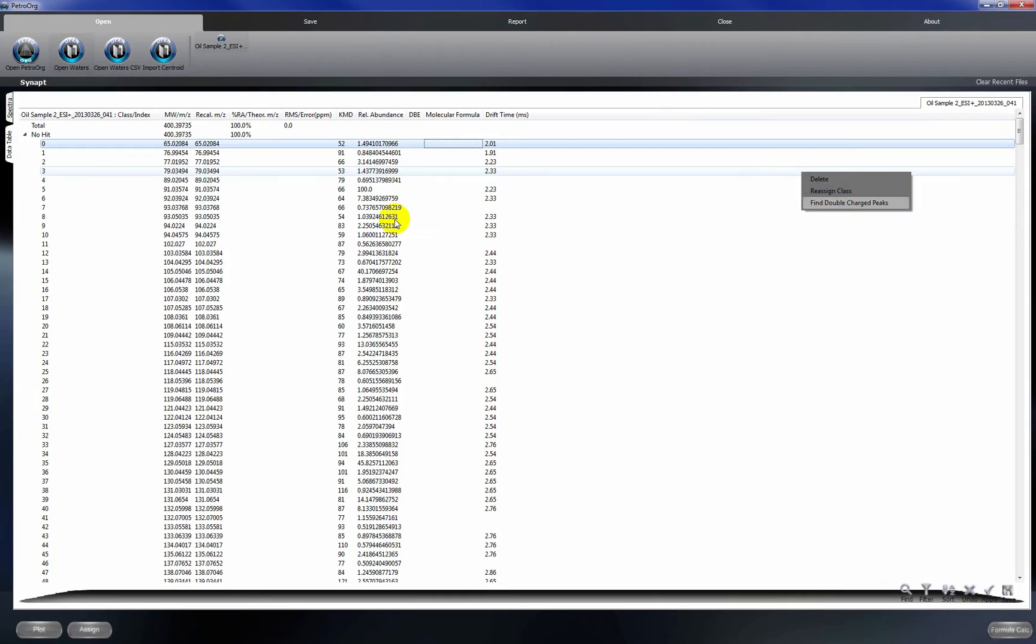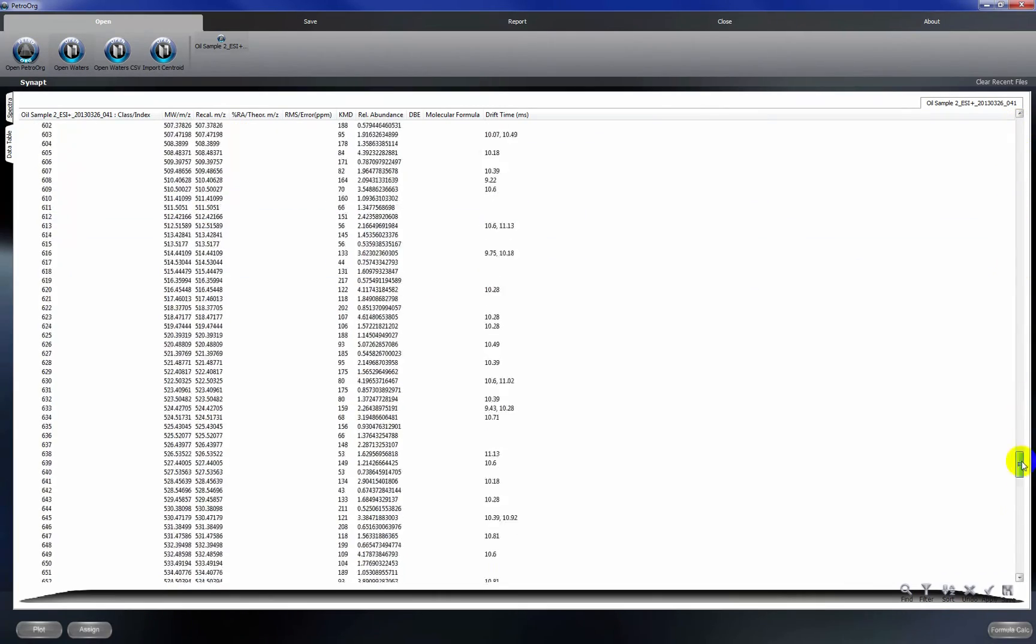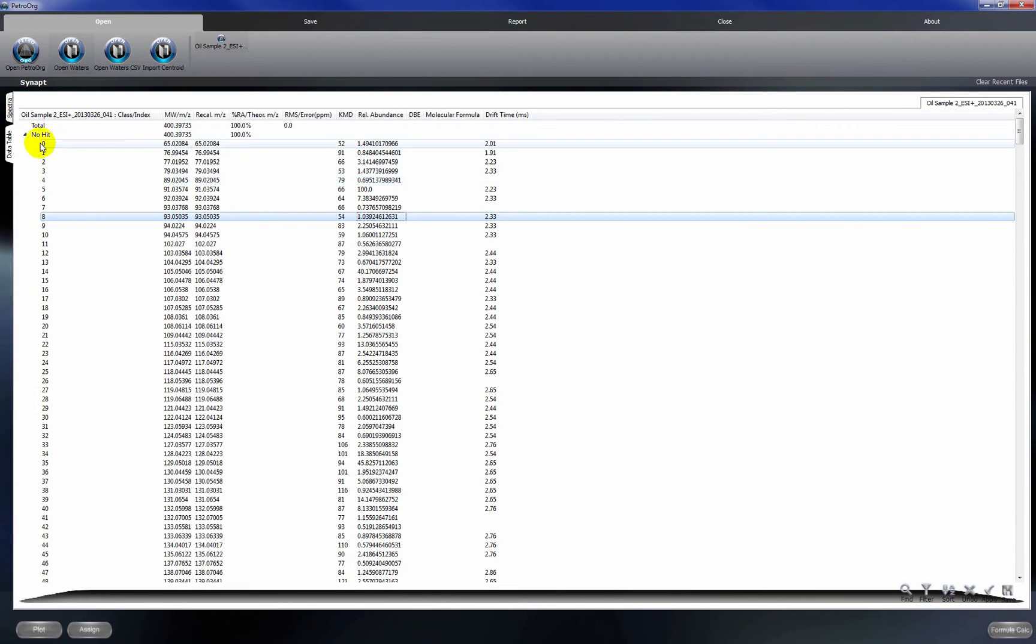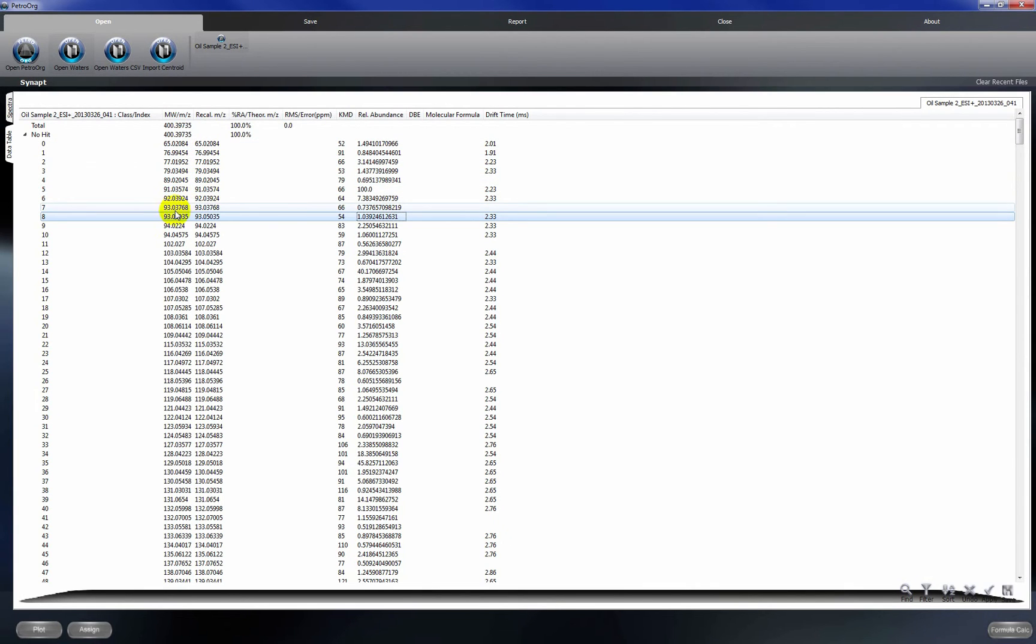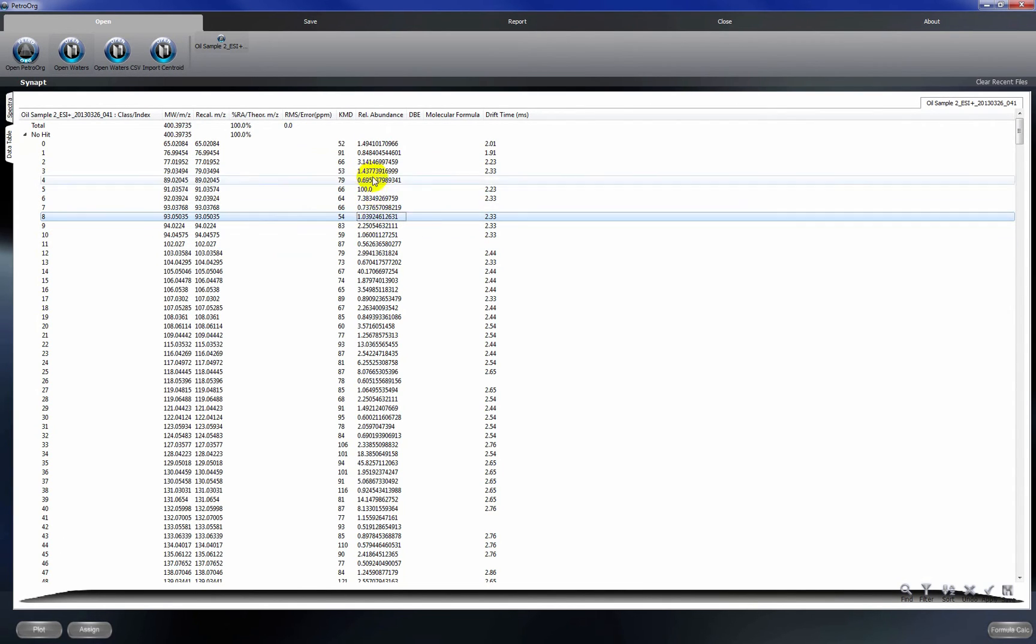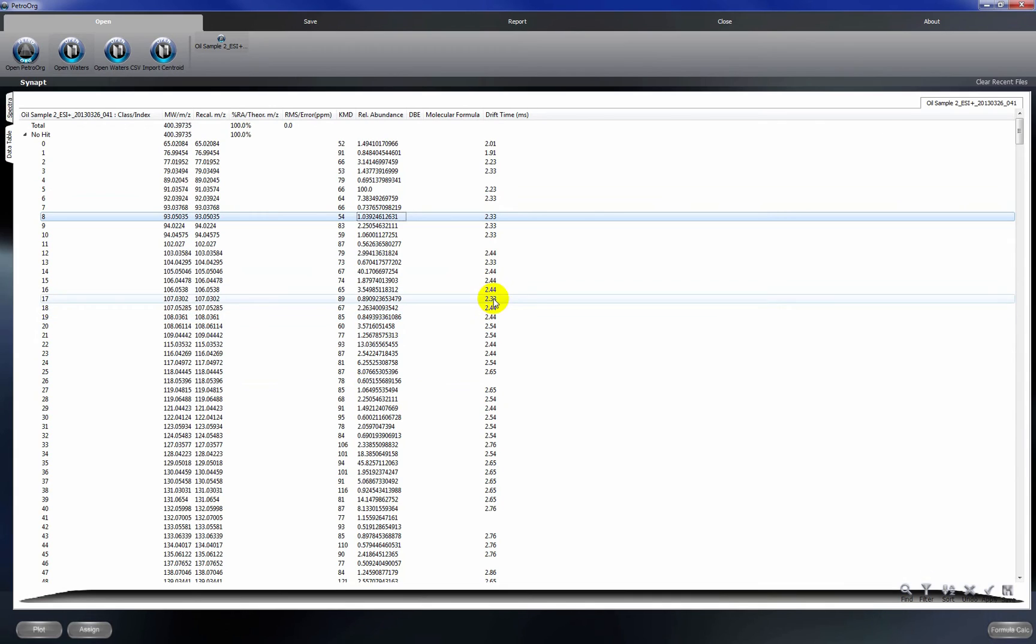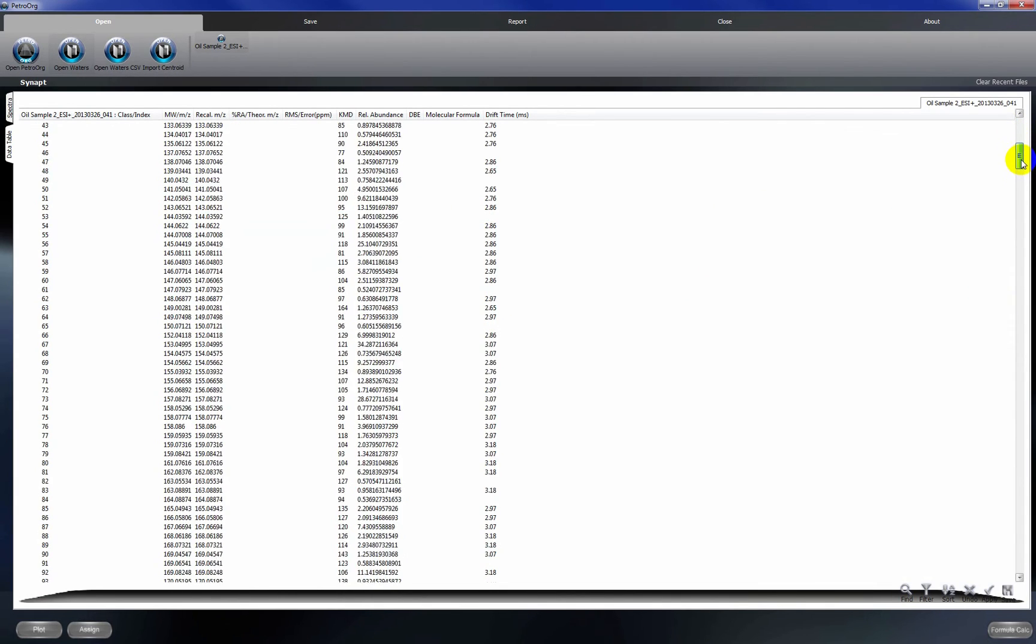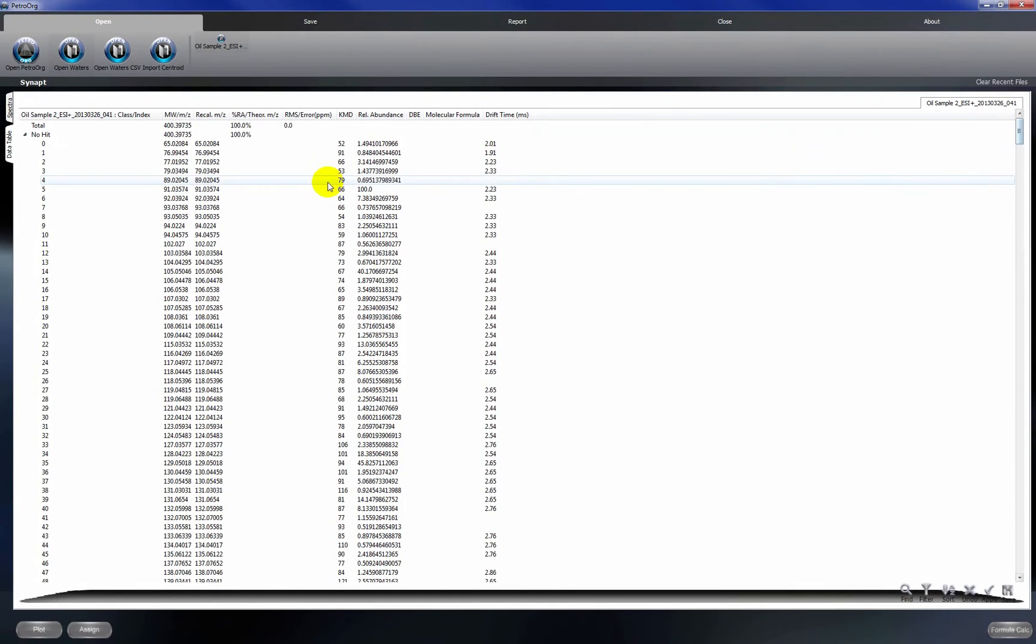Essentially, you can see here we have a peak list with the number of peaks in the far left column, the M over Z and the recalibrated M over Z value. So right now, these values are the same because we haven't recalibrated the spectrum yet. The percent relative abundance, the relative abundance for each peak here, and then the drift time for each peak is located in the far right box. What you'll see is that for peaks that have a bimodal drift time, you'll get two separate peak maximum values for drift time.